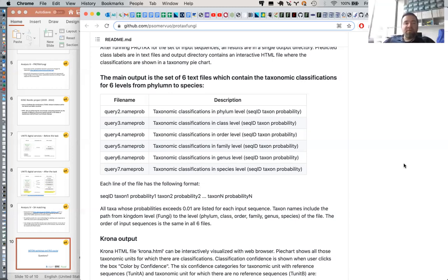And let's say a person like me with maybe 100 million fungal ITS sequences is coming, do I have a chance to analyze this data in this framework, or is it just too much? Well, for this analysis, we have limits, so you can analyze 1,000 at a time. But I think these are meant not for the so-called raw data, but for analyzing representatives only. Okay, then yeah. If there are 1 million representatives, I should divide this into 1,000 batches. Yeah, or you can download the standalone version and run it either on a computer cluster or locally.